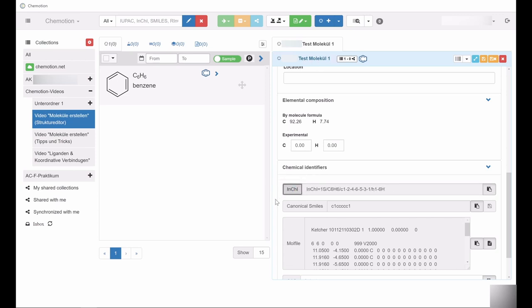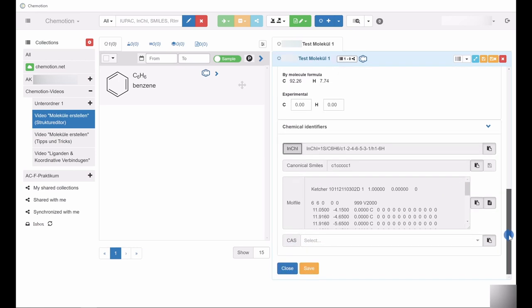Alternatively, SMILES codes can be inserted at this point, which results in an automatic generation of the corresponding structure. This process will be explained in detail in a dedicated video.